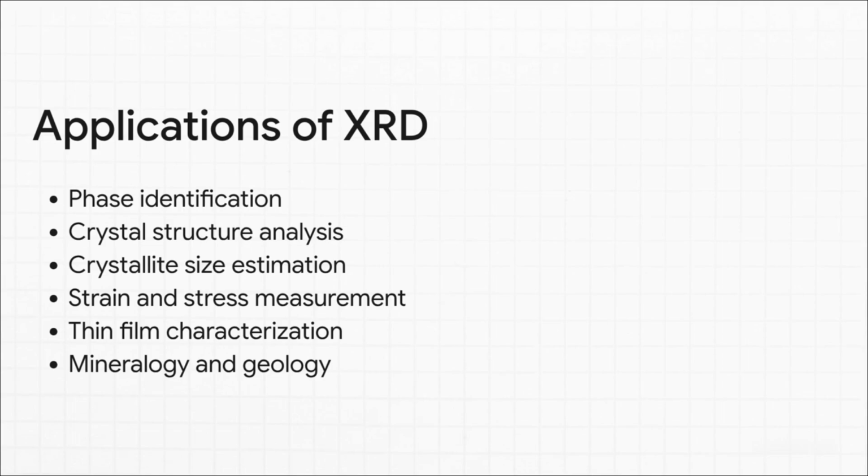It's also absolutely crucial for thin film characterization in the semiconductor industry, which, by the way, is what ensures your computer chips actually work properly. And of course, it is a foundational tool in mineralogy and geology, whether you're identifying rocks pulled from deep inside the Earth or even samples drilled right out of the surface of Mars.